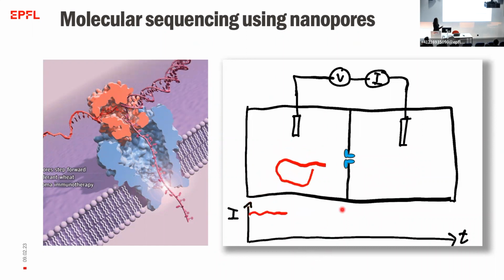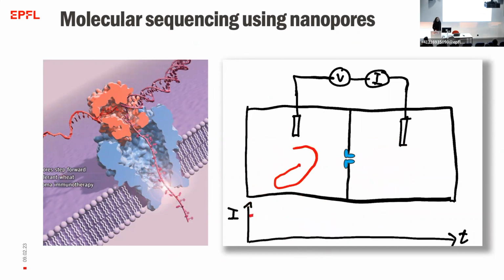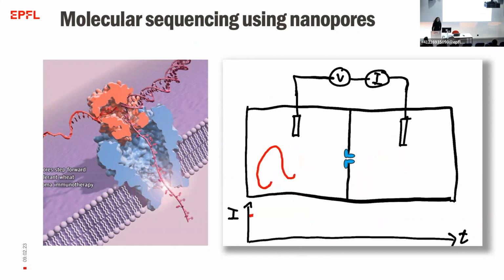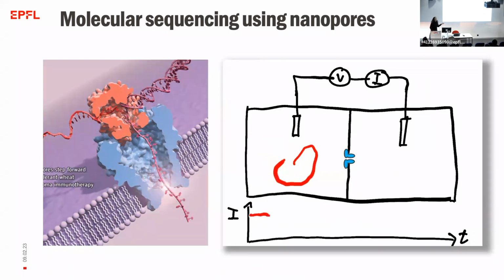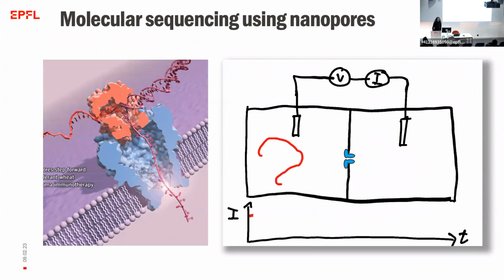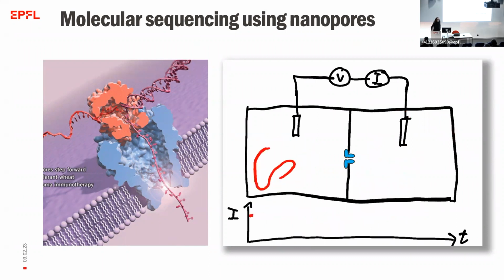And at the heart of nanopore sequencing actually lies a biological pore, which is in fact coupled with a biological motor that regulates the speed at which the molecule passes. In the early beginning of the research with nanopores, people were hopeful that they would have electronics sufficiently fast to measure the signals for these free translocations.